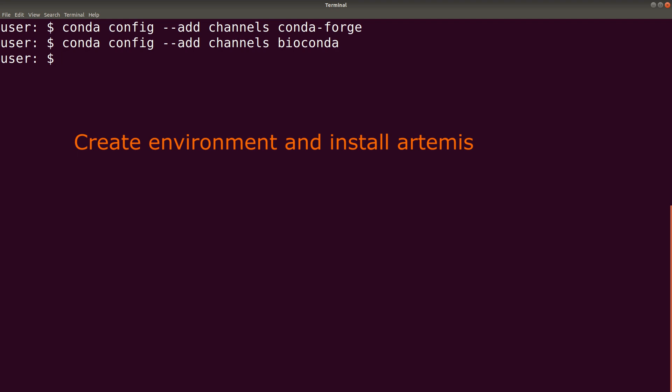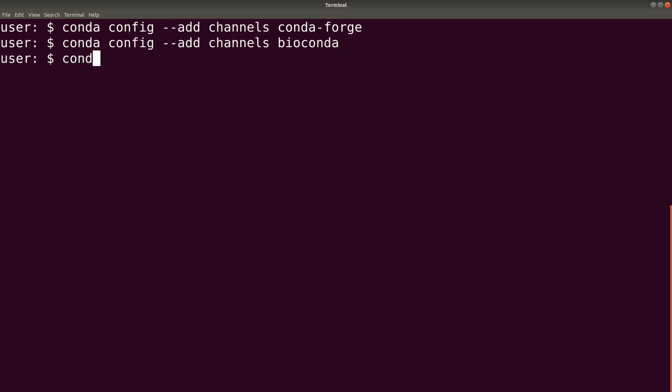After we are done with that, it is now time to create an environment and install the Artemis. So we do that with just a single line. So we create the environment by saying conda create -n. Then the environment will use Artemis.